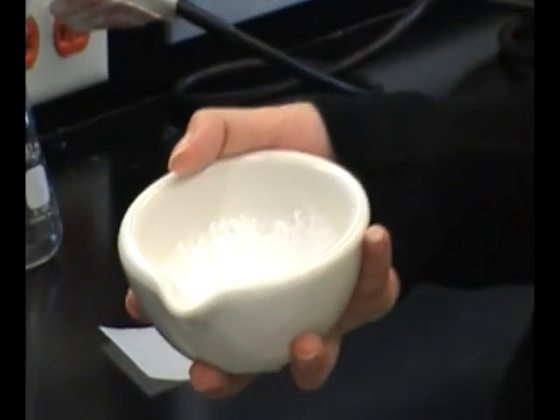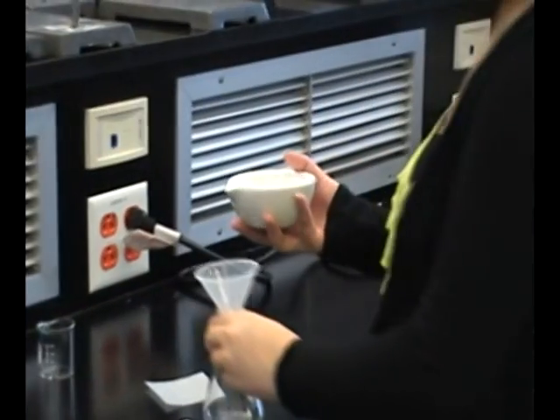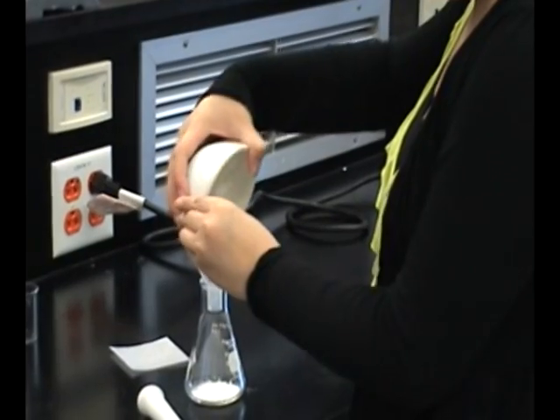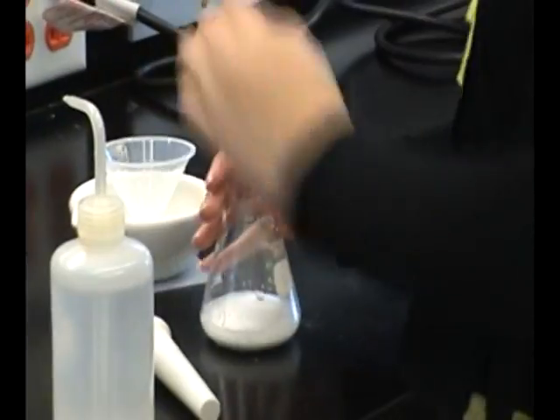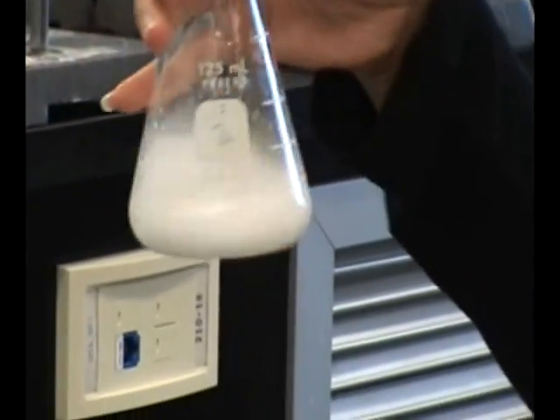Once the tablet is finely ground, pour it into a 125ml flask using a funnel. You can use a little bit of deionized water to help wash it into the flask. Now you want to put in boiling chips. Once you fill up your total solution to the 50ml mark, swirl it around a little bit and put it on the hot plate. Note that there are insoluble solids in the solution, so it won't go completely clear.